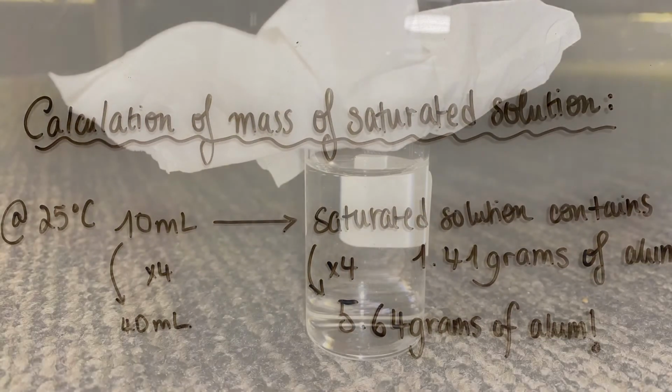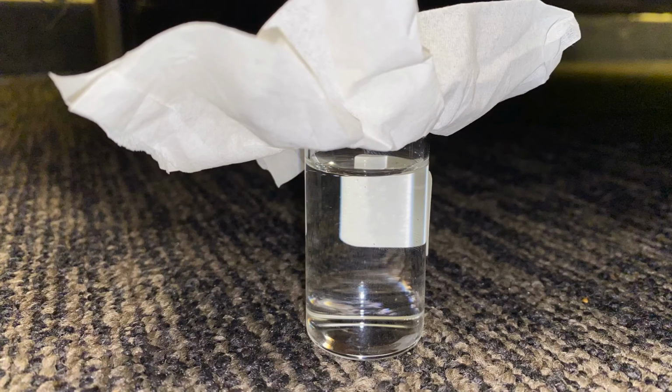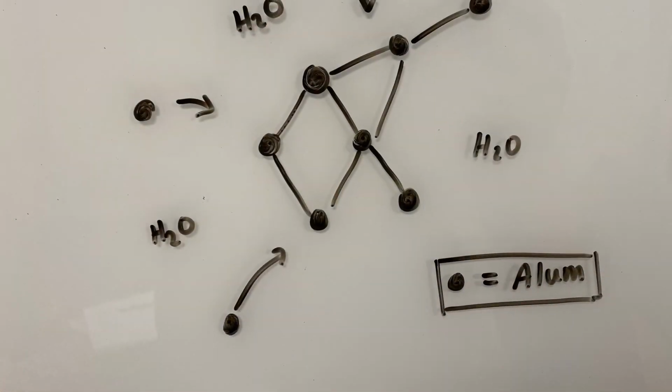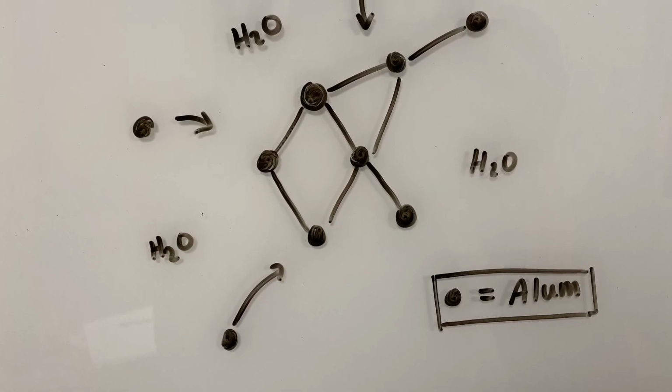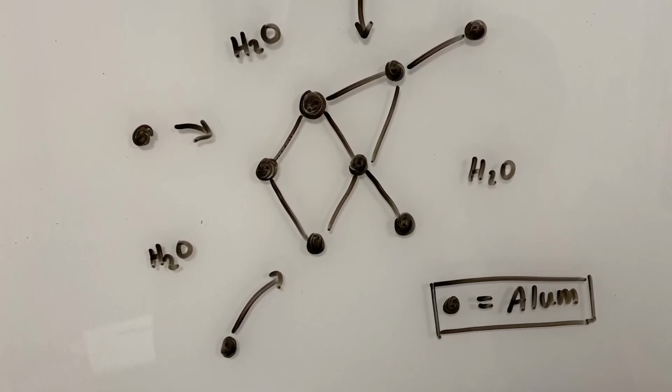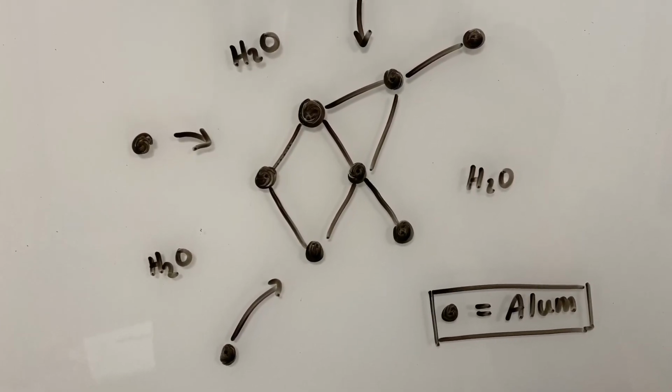The crystals do not appear to have formed so far. This is considerable as the experiment was performed on Wednesday afternoon, 2 days prior. In other words, it can be inferred that nucleation, the time required before the solution can start transforming itself into a crystal, is still ongoing. The ions are still positioning themselves to form a crystalline geometry.